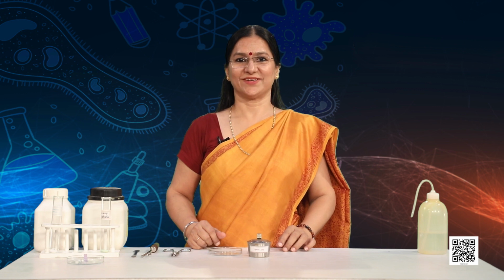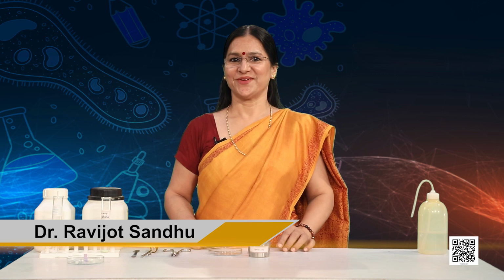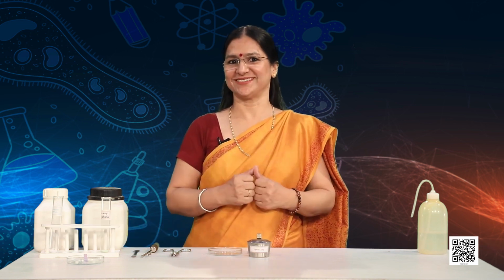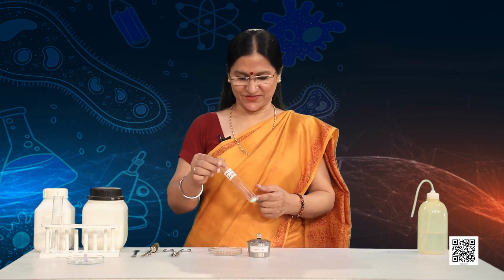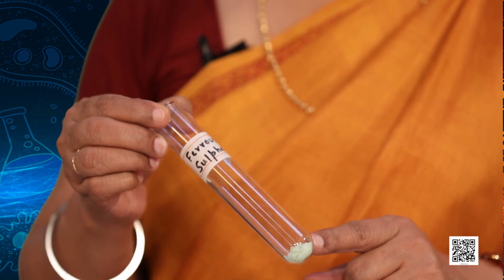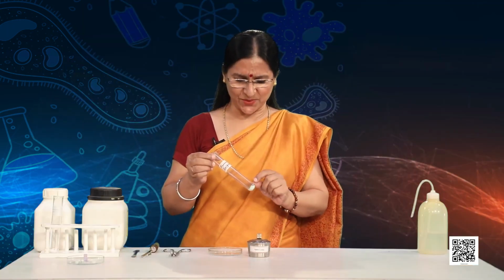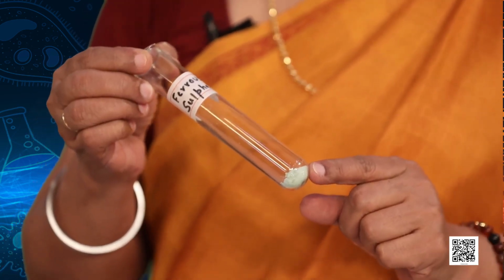Hello young friends. We are discussing types of chemical reactions. So far, we have discussed combination reactions. Let's explore further. As you can see, in a boiling tube, I have taken 2 grams of ferrous sulfate crystals. I want you to note the color of the ferrous sulfate crystal. Aren't they light green in color?